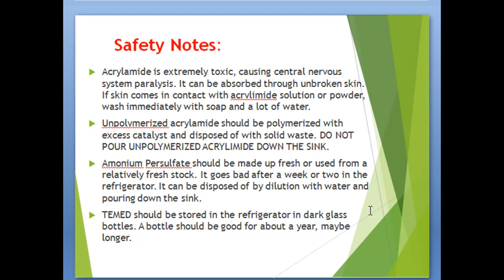Safety notes: acrylamide is extremely toxic, so be cautious when using it. Ammonium persulfate should be made fresh, and TEMED should be stored in a refrigerator in a dark bottle.